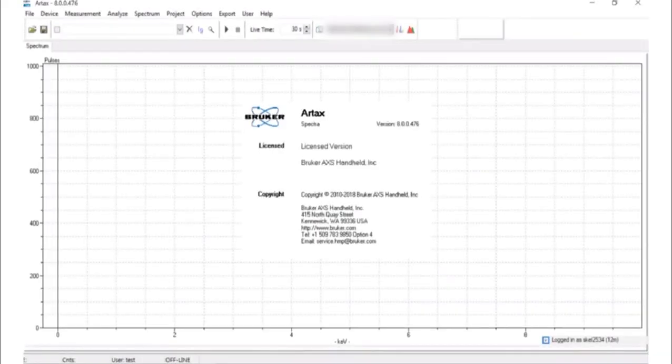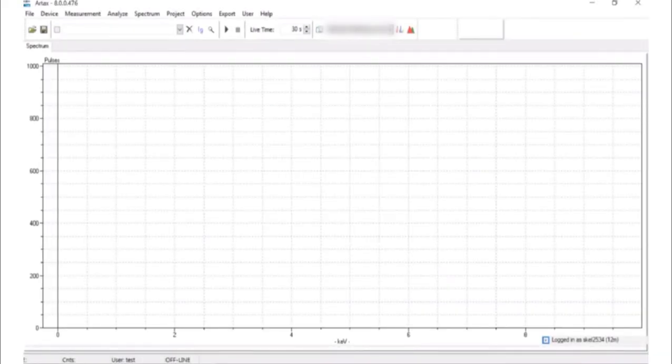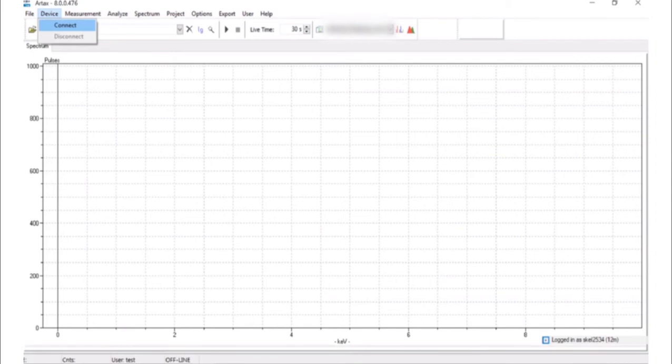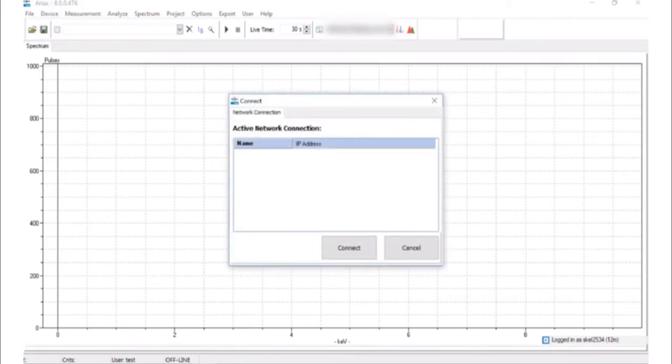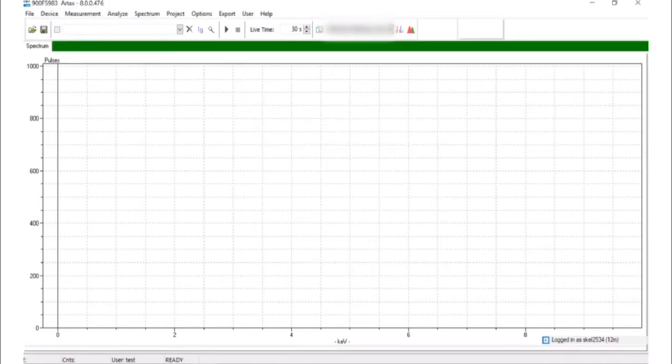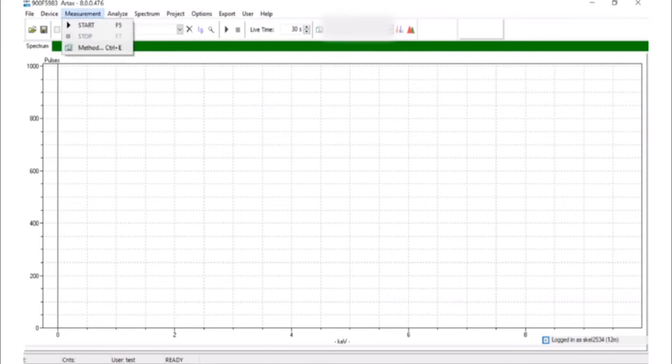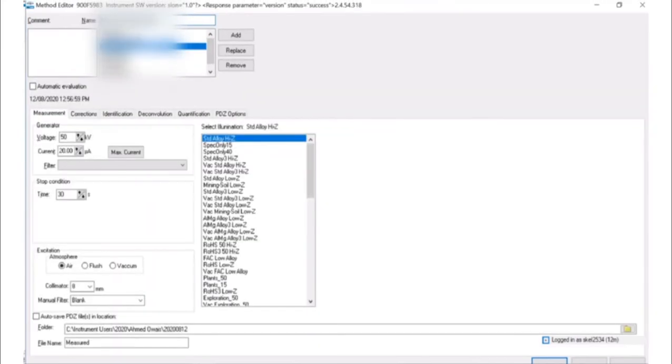Open the Artax software. On the toolbar under device, select connect. A box will appear with the instrument serial number and IP. Click connect. When the instrument and computer are connected, a green bar should appear. Open measurement method to bring up the method editor.